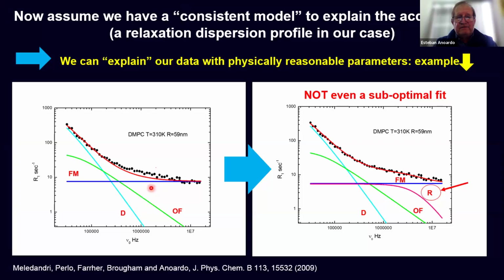So this was somehow shown in many talks in the past, but again, here is a good introduction. As an example, we are using this liposome. So you see that when we add these three models, and after we check that there is no cross-correlation between them, meaning the cross-correlation functions are really negligible, and we extract information about the corresponding physical parameters involved in this model from the literature, we get this red curve. So there is no fitting here.